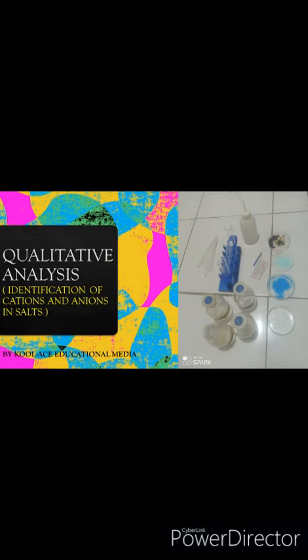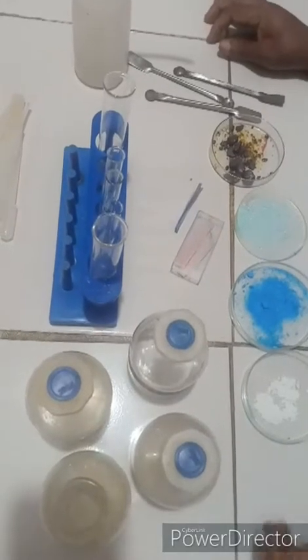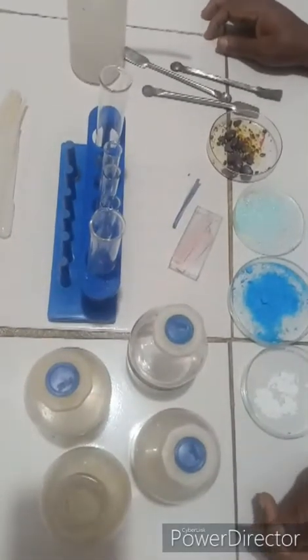Okay, welcome to this class. This is qualitative analysis in chemistry. In chemistry, we have two types of analysis, quantitative and qualitative analysis. In quantitative analysis, we measure. Examples are acid-base titration and redox titrations. But qualitative analysis is a test to identify cations and anions in salts.